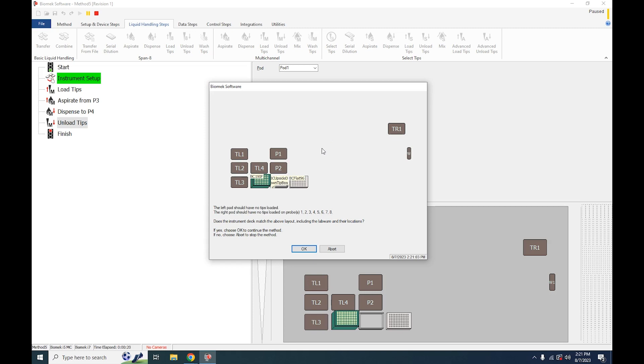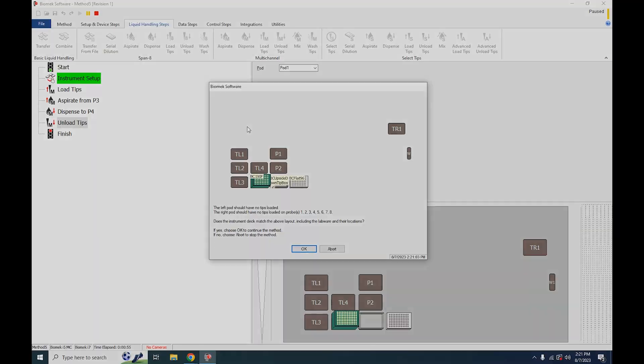Before you run your method, make sure there's nothing on your deck besides what you intend to be there. Make sure your deck is clear of all obstacles to prevent any unnecessary crashes.